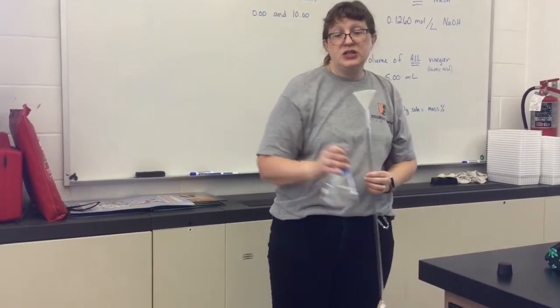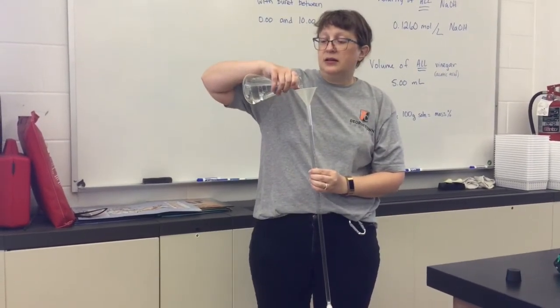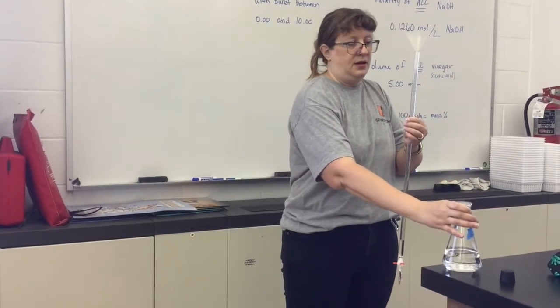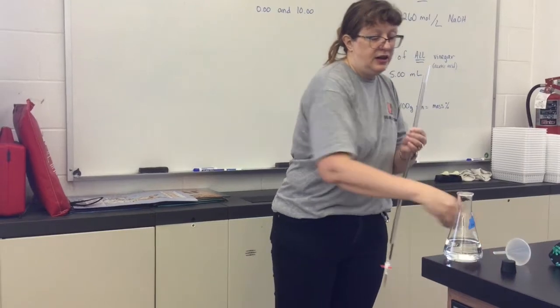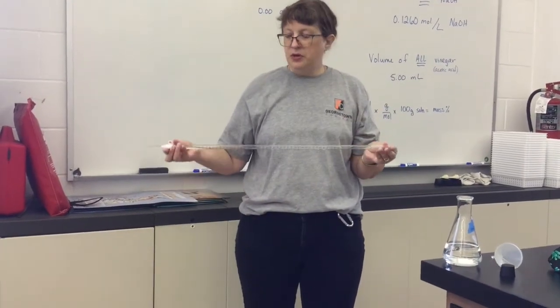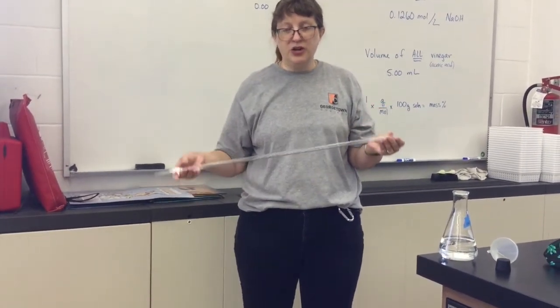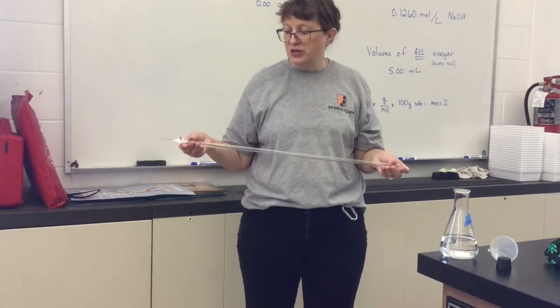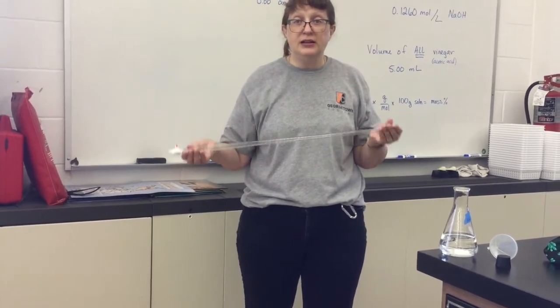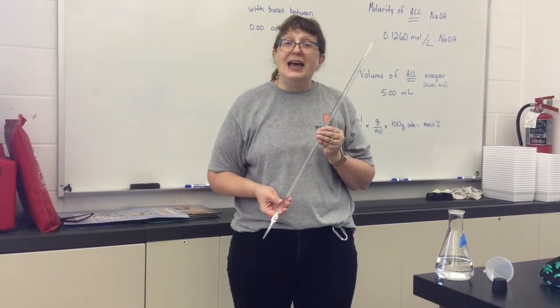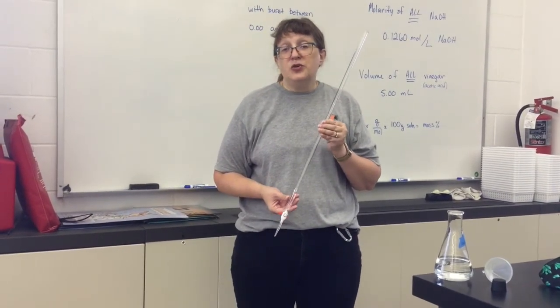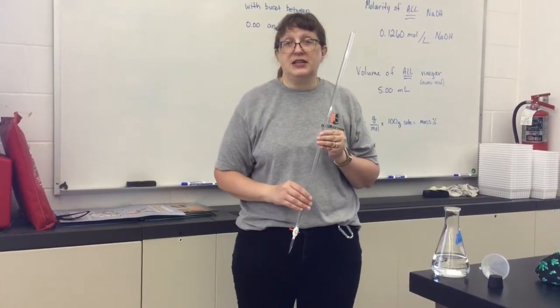It's best to do this over a sink. Then you will remove the funnel and tip the burette back and forth a little bit, turning it as you do so that you can rinse out the length of the burette. After you do this, drain a little bit into the sink and then dump the rest out so that you can fill it with fresh sodium hydroxide.